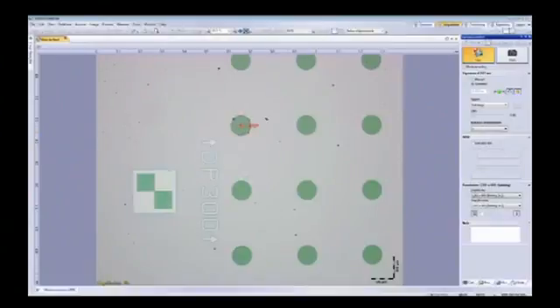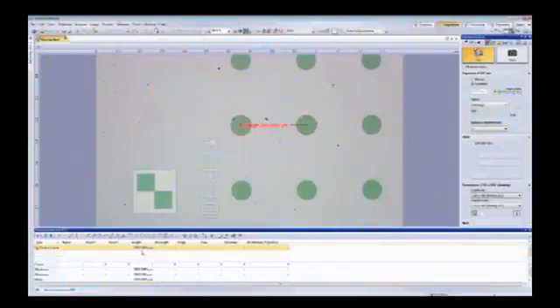We can come out here and mark 3 points of a circle and move over and mark 3 points of the circle that you want to measure the length to. And so now it's showing the length right on the image, and all of these manual measurements can be exported to a workbook, then out to Excel or embedded into reports, transferred right into your PowerPoint. So it's storing this also onto a table in the software right down here. Okay, yeah, so your features pop up down there.